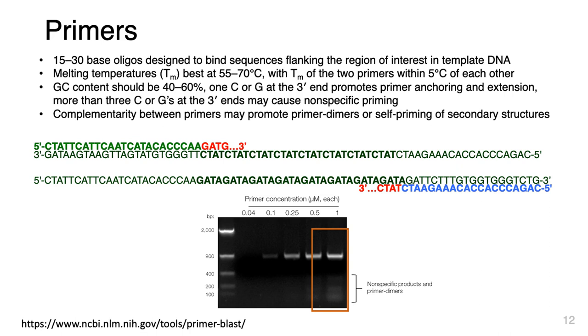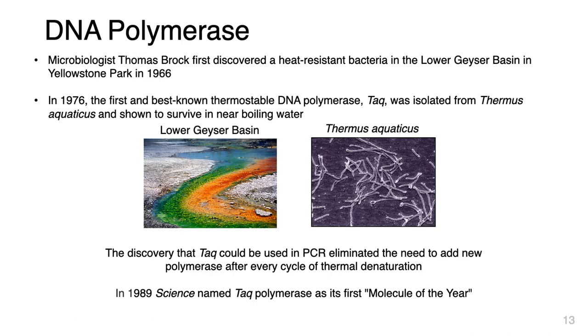The one I've listed is for NIH through the NCBI, a tool called Primer Blast. It's very helpful in developing primers. The third ingredient needed for PCR is DNA polymerase.